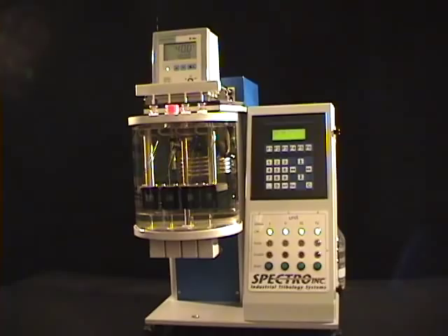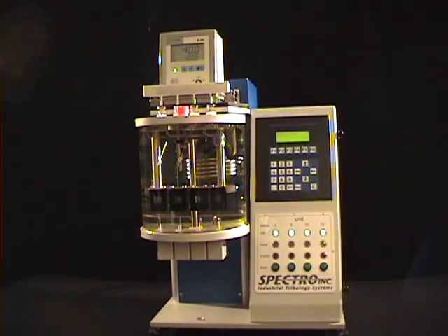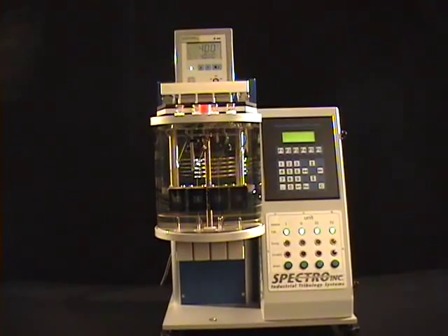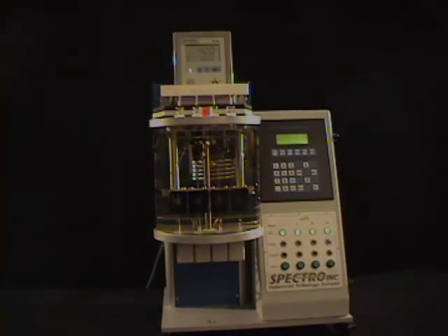As demonstrated, the SpectraVisc is a user-friendly instrument. It provides continual information to the user and allows full control over all measurement parameters. To learn more about the SpectraVisc and other Spectra products, visit our website at SpectraInc.com.